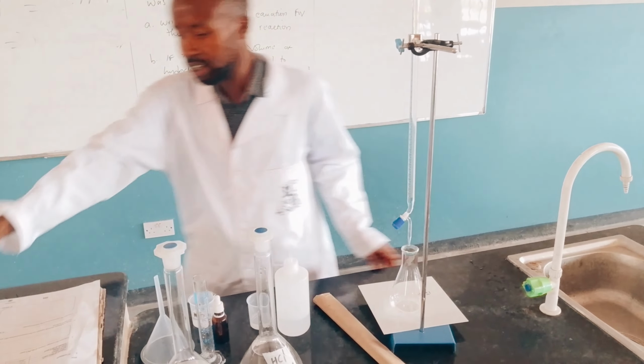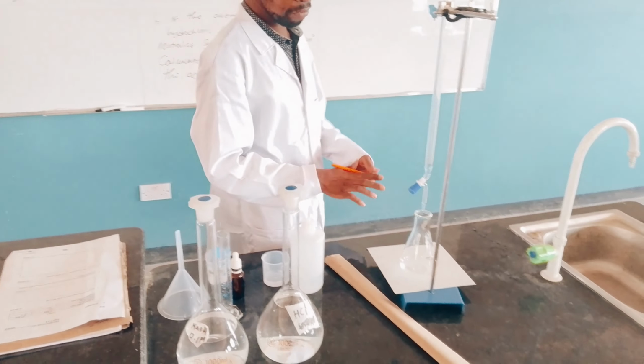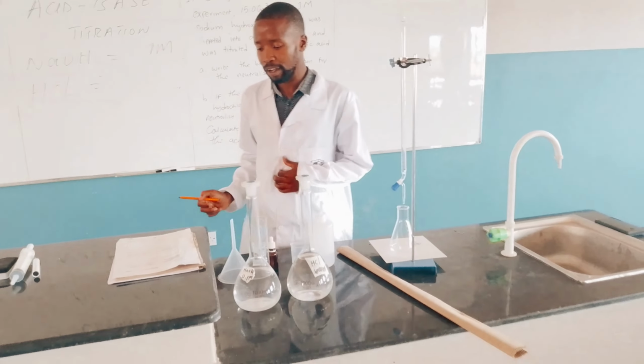At first, our initial volume was 50. After our first titration, the volume is 45.